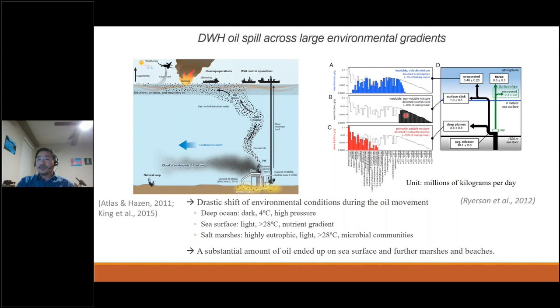But in the sea surface, the oil slick, this is what you get. It's the very heavy, higher carbon number hydrocarbons. But in the deep water plume, this red bar, that's the type of hydrocarbon you get: a lot of small aromatic compounds.